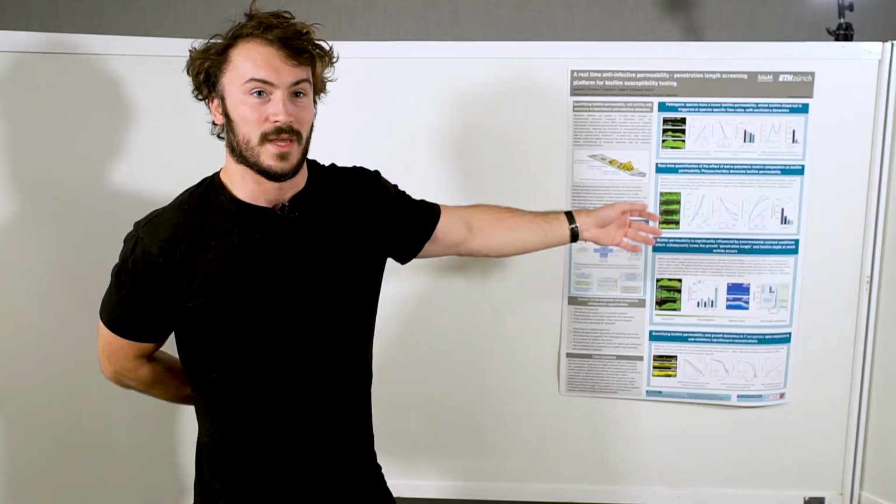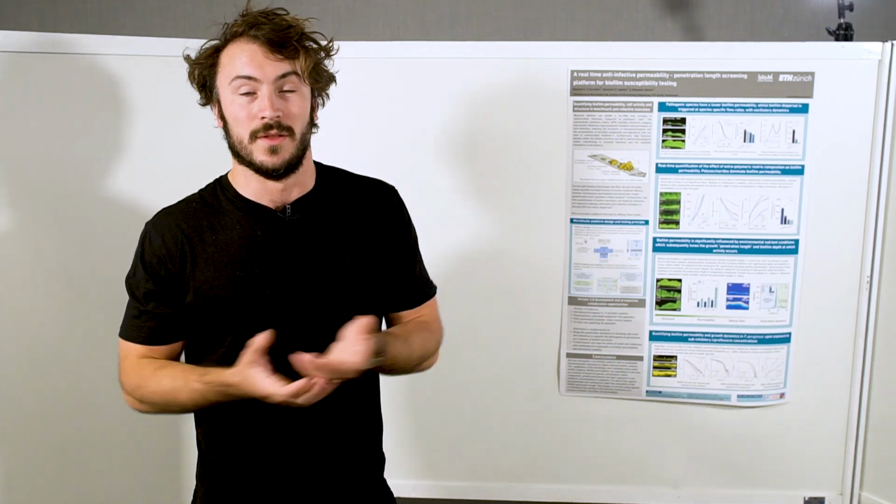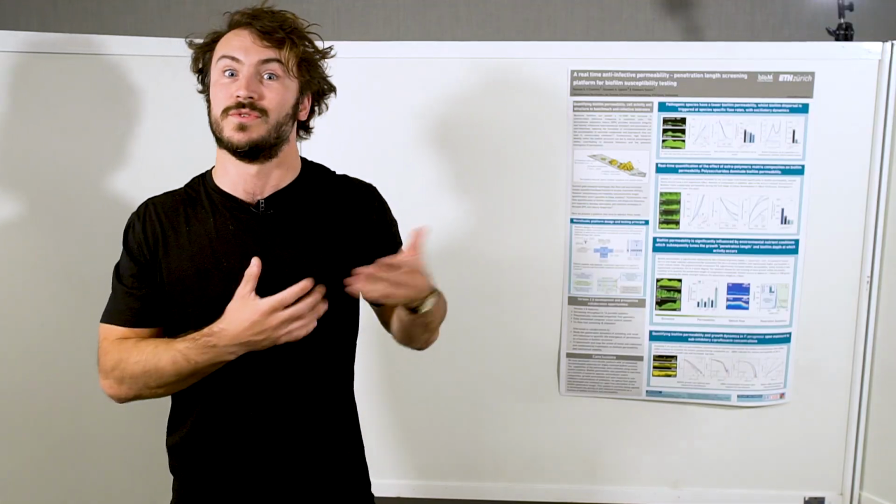Within this, we then calculated what we call the penetration length of our treatment within our biofilm. So not only are we able to quantify the amount of killing biocidal effect going on, we're also able to measure the penetration range within the biofilm at which the treatment is having an effect. And this is quite cool because this enables us downstream to model the gradients within the biofilm, superimpose our penetration lengths, and then data mine what kind of gradients are causing the failure of the treatment.